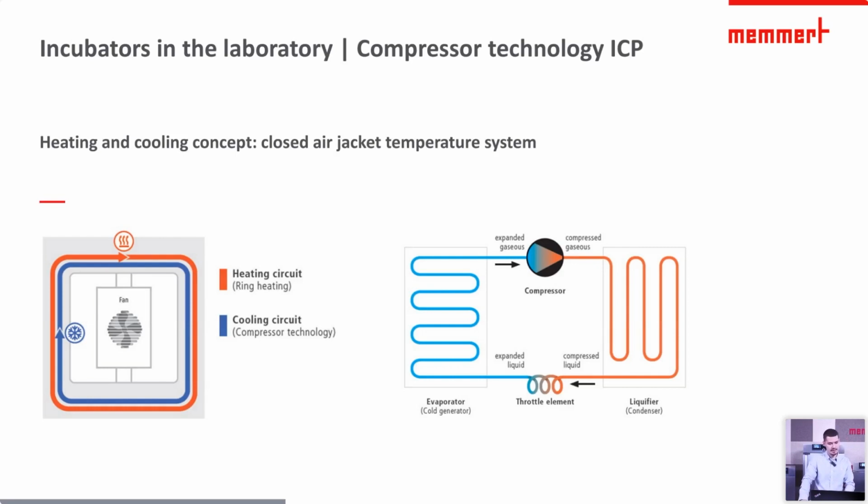The refrigerant circulates in a closed circuit. In the evaporator, the refrigerant absorbs the heat from the sample that has been introduced and is to be cooled. The compressor compacts the refrigerant under high pressure. The condenser, which is located outside the appliance, releases the heat into the environment. The refrigerant condenses and returns to a liquid state. The pressure in the throttle valve is reduced again, so the boiling point of the refrigerant drops and the next cycle begins.